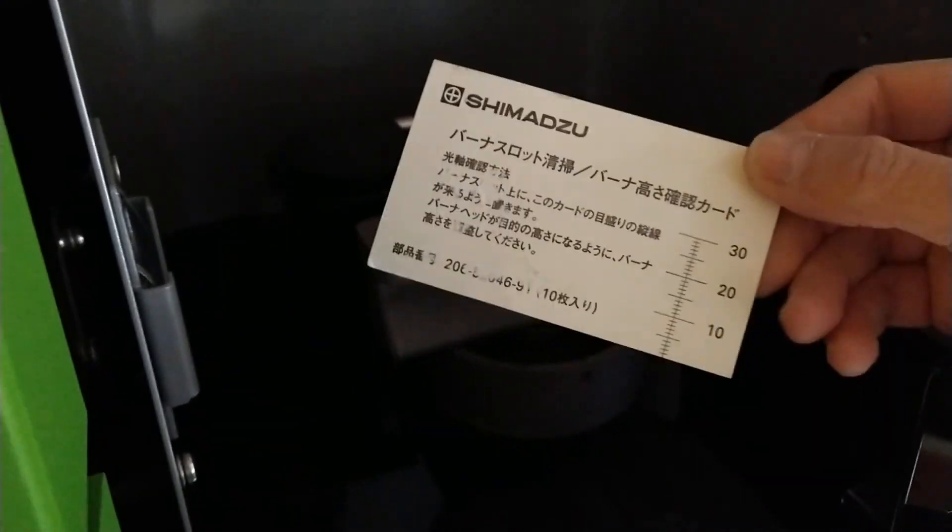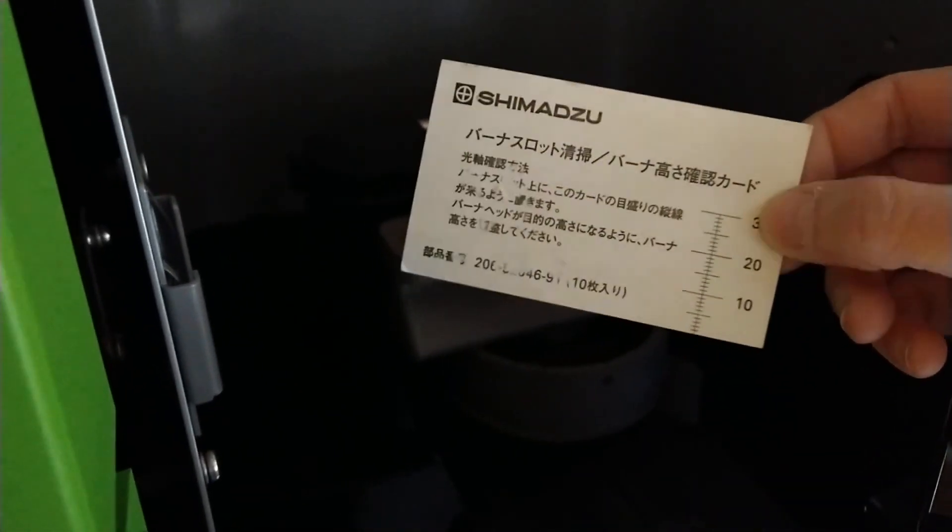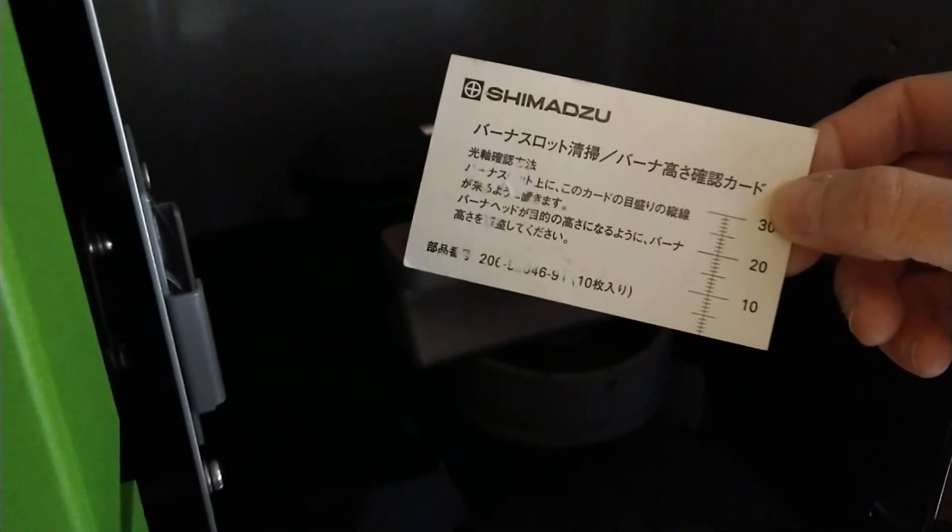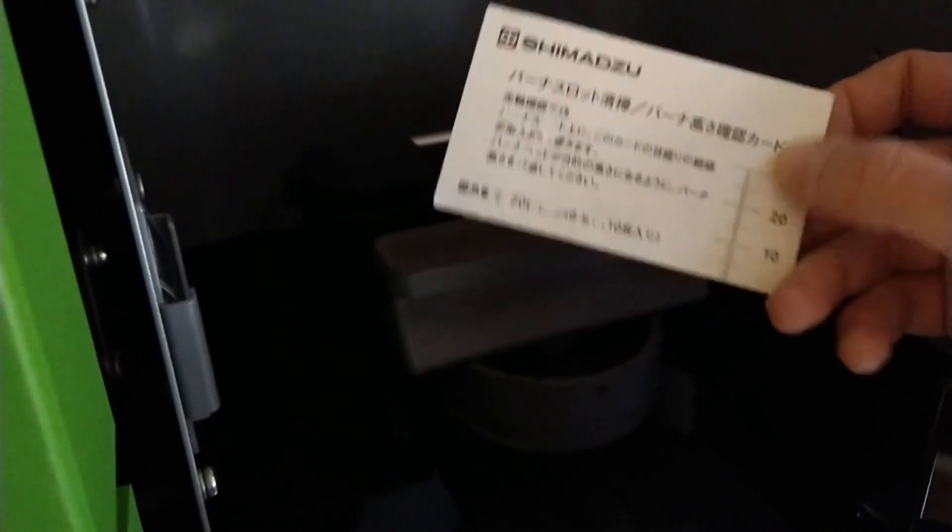The tool is a business card with some measurements on it, a vertical line and some horizontal lines. We're going to make sure that the hollow cathode lamp light is the same at the front of the burner head and the back of the burner head, same height and position horizontally across the burner.